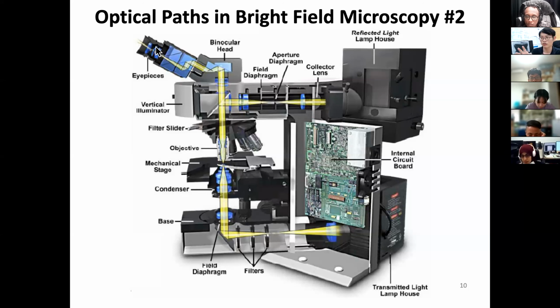So in your laboratory, you'll find this very expensive-looking type of microscope, but you learned about the 4F system. You now know what a 4F system consists of: the objective lens as one single lens. But there has to be another lens before making focus onto your eye, or on the sample, or your CCD camera. There has to be one somewhere. Look for that. And here I want to show where the tube lens is located. You see it's collimated light, so it's a 4F system.